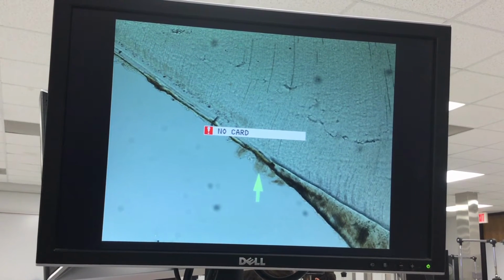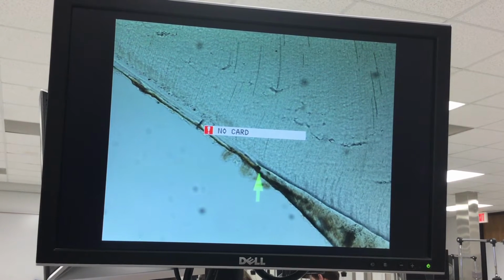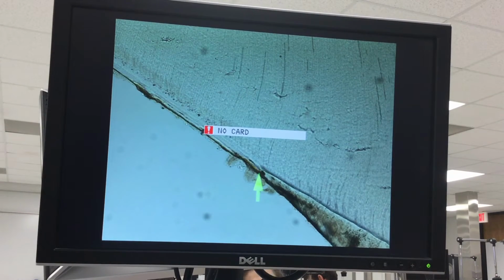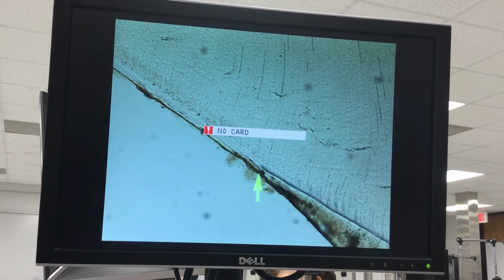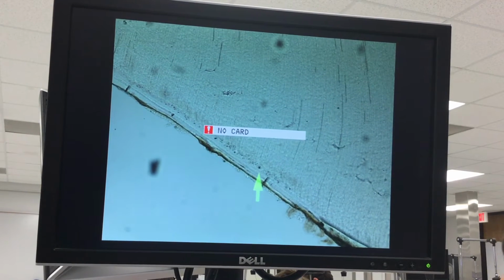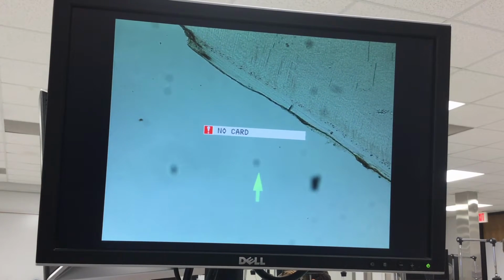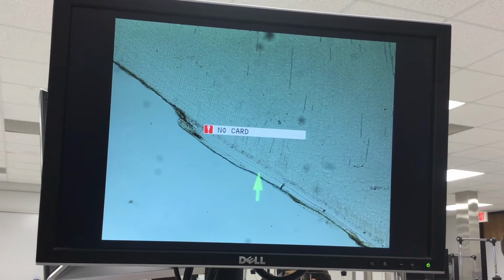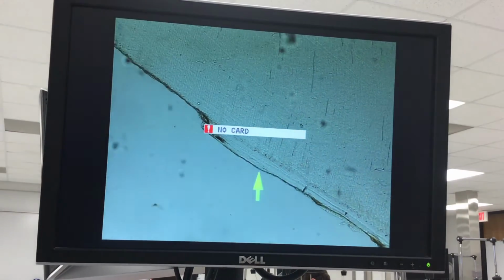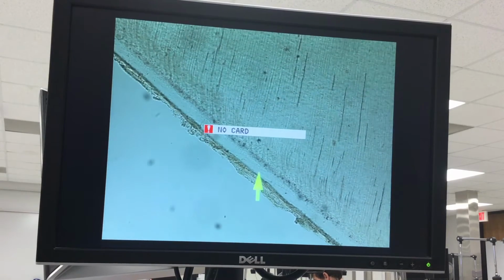And right here, there is the edge of the enamel, so we have a little bit of overlapping cementum. That's mostly the case that we'll see. So we're coming down to the acellular cementum, and let's go down here a little ways. You can just barely make out some incremental lines in this ground section. And some of it is flaked off here. And we pick it up again right here.